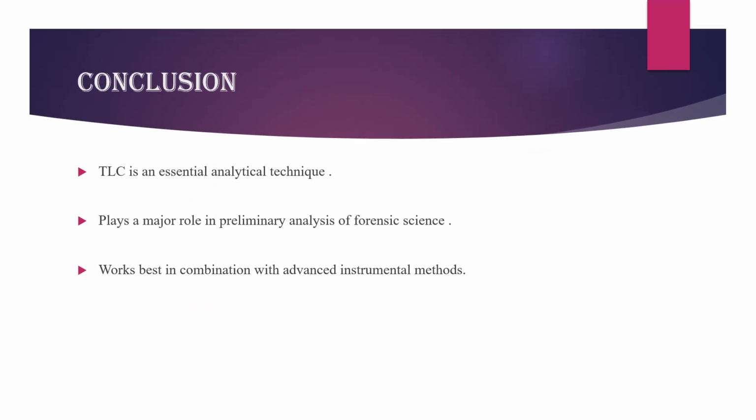In conclusion, thin layer chromatography is a fundamental analytical technique. It is extremely useful for preliminary analysis in forensic science. Although it has limitations, it becomes very powerful when combined with advanced instrumental methods.